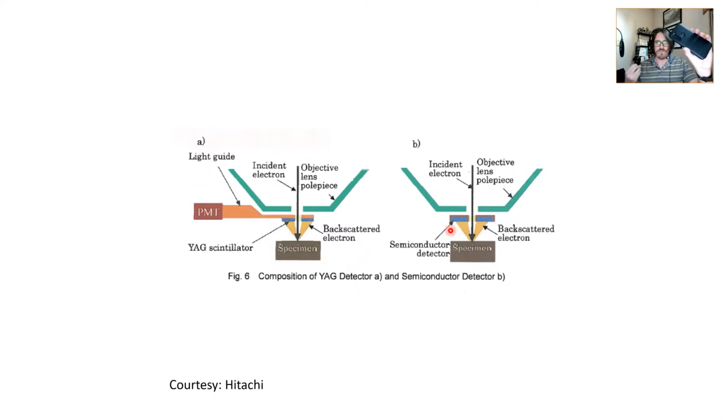Very, very similar. This CMOS image sensor is detecting photons. It's using basically the fact that there's wave particle duality between photons and electrons. So a photon is a packet of energy. In this type of scenario, an electron's basically a packet of energy, and so it's kind of, I guess, more of the particle aspect of the wave particle duality. Very similar to the CMOS image sensor on your phone. And so that answers the question posed at the beginning of this lecture.